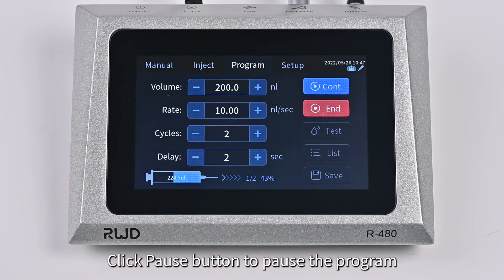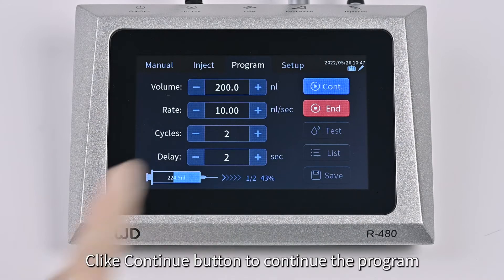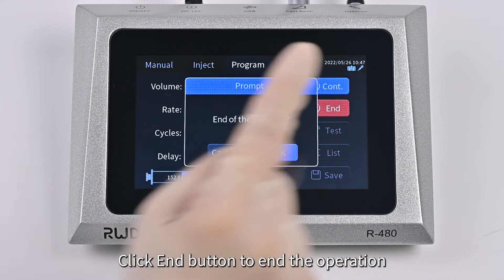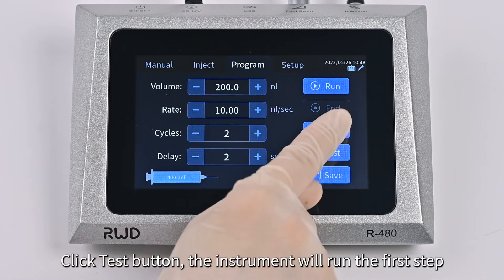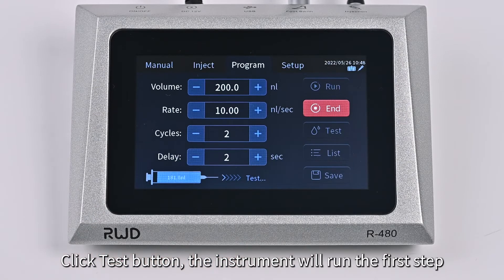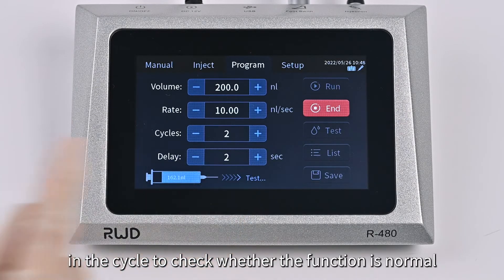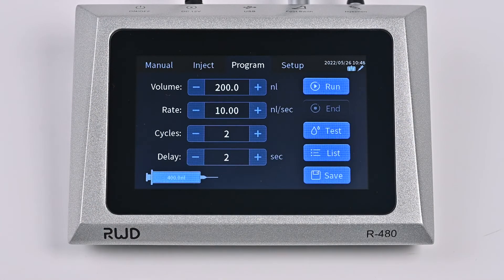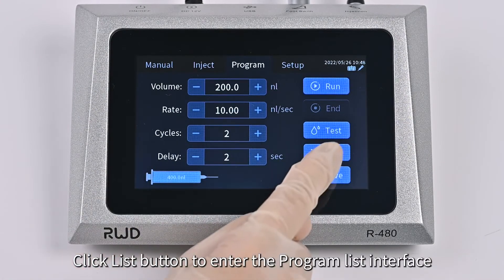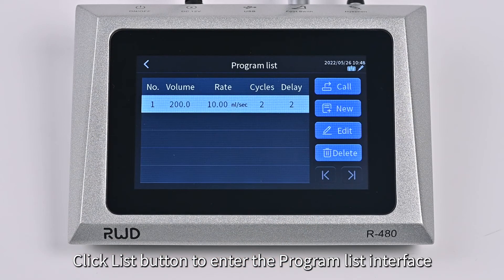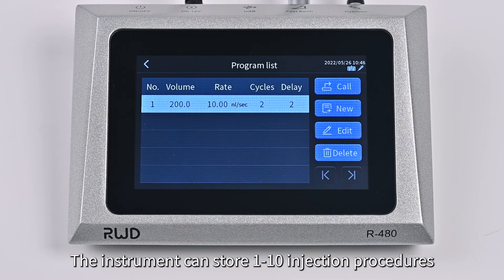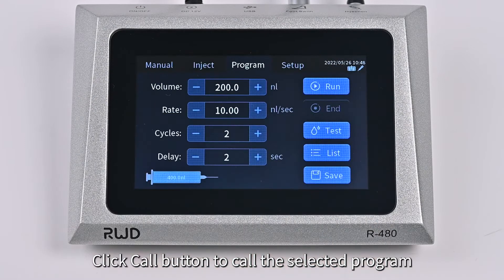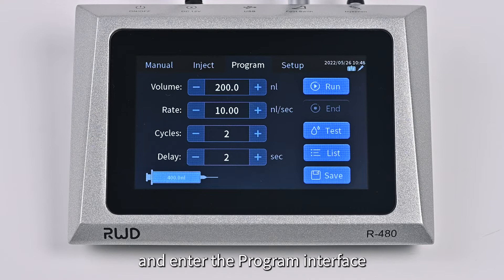Click Pause button to pause the program, and Click Continue button to continue. Click End button to end the operation. Click the Test button and the instrument will run the first step in the cycle to check whether the function is normal. Click End button to end the test. Click the List button to enter the program list interface. The instrument can store 1 to 10 injection procedures. Click the Call button to call the selected program and enter the program interface.